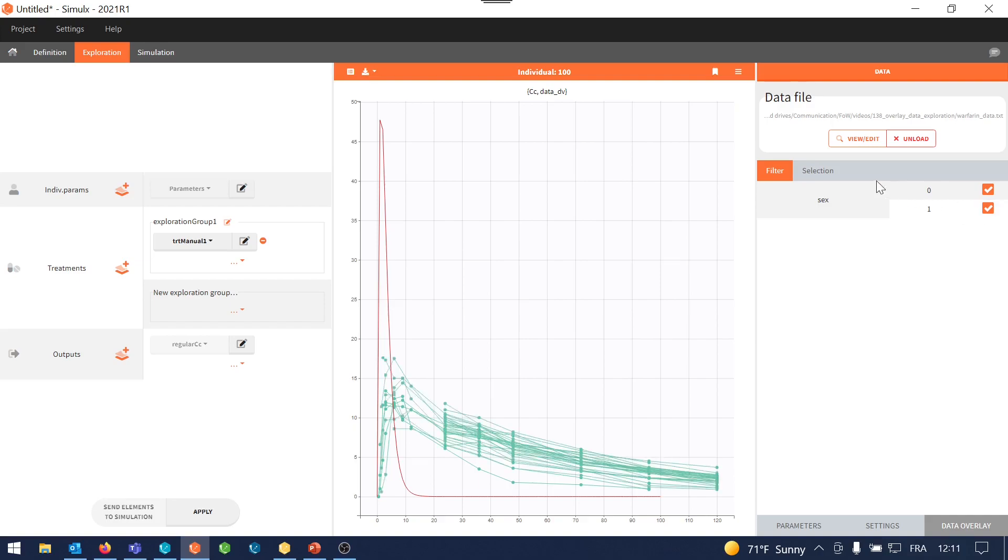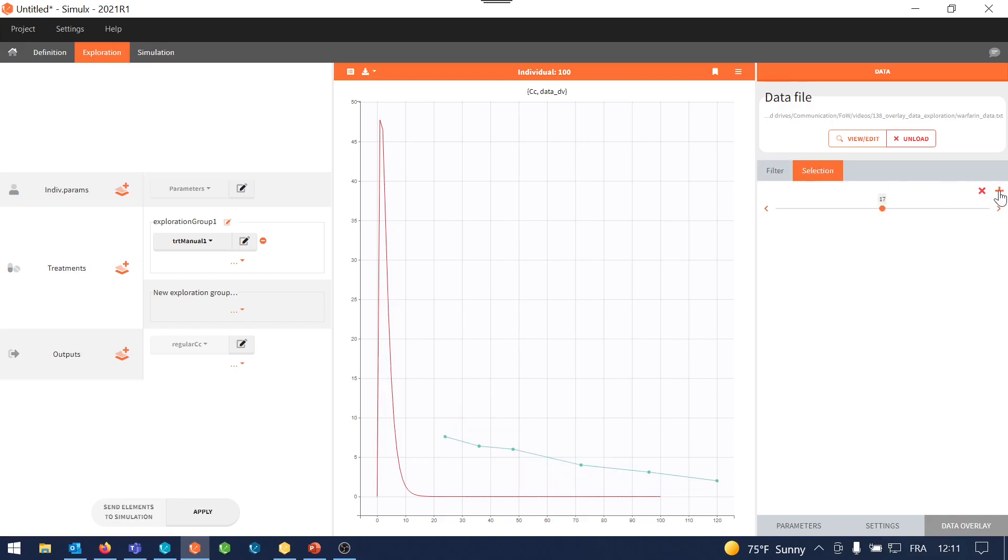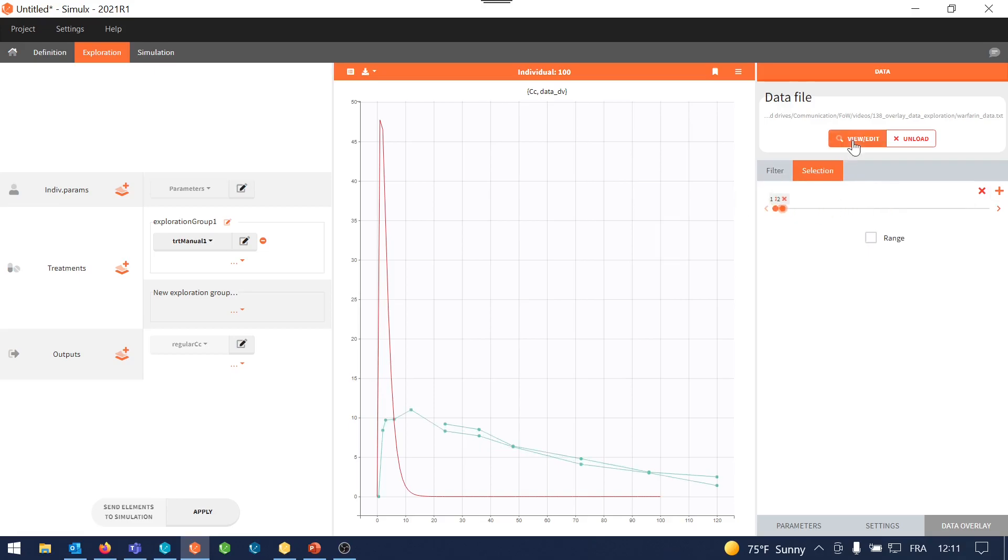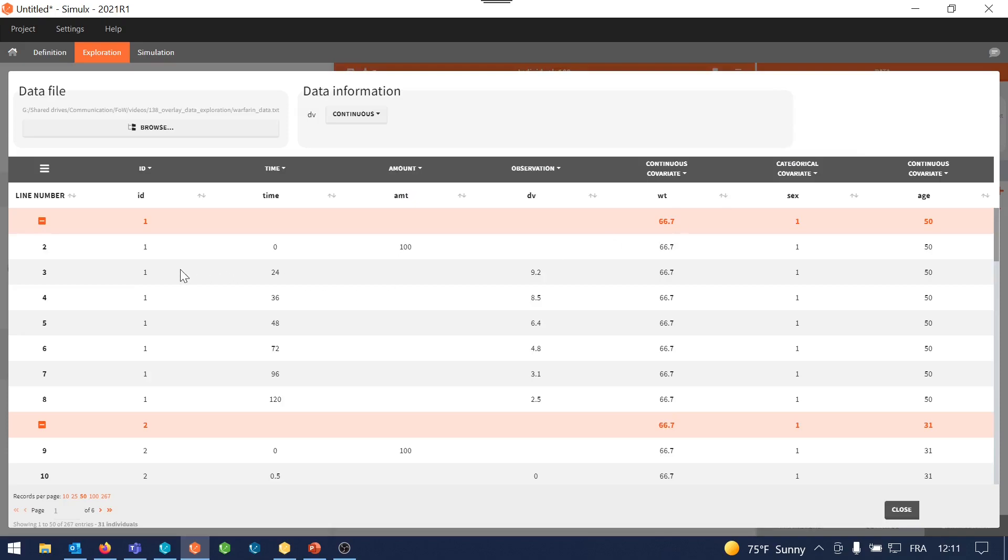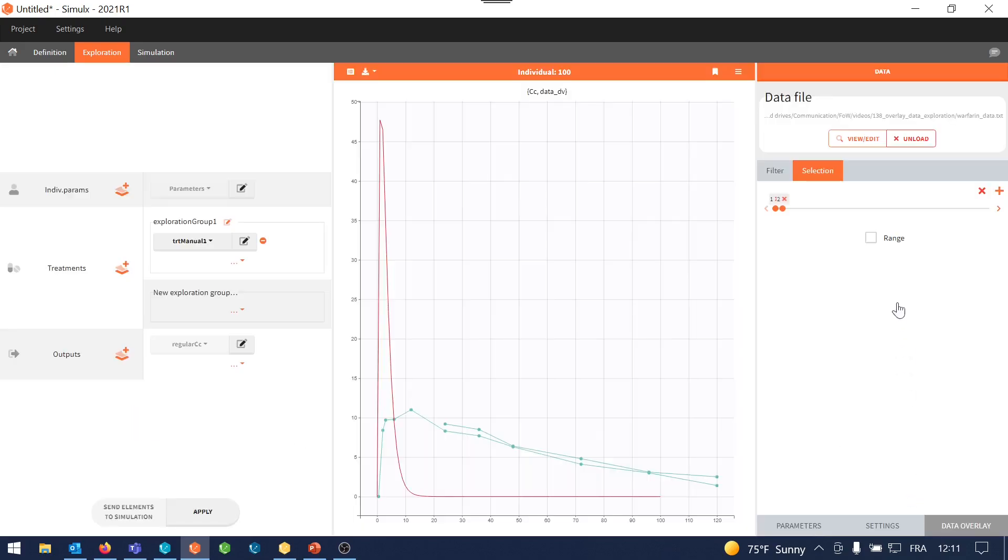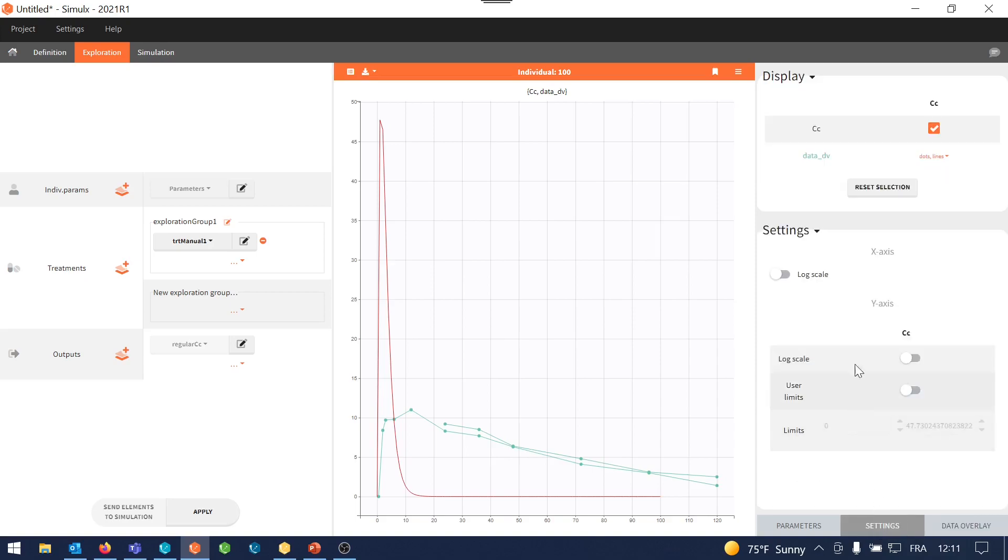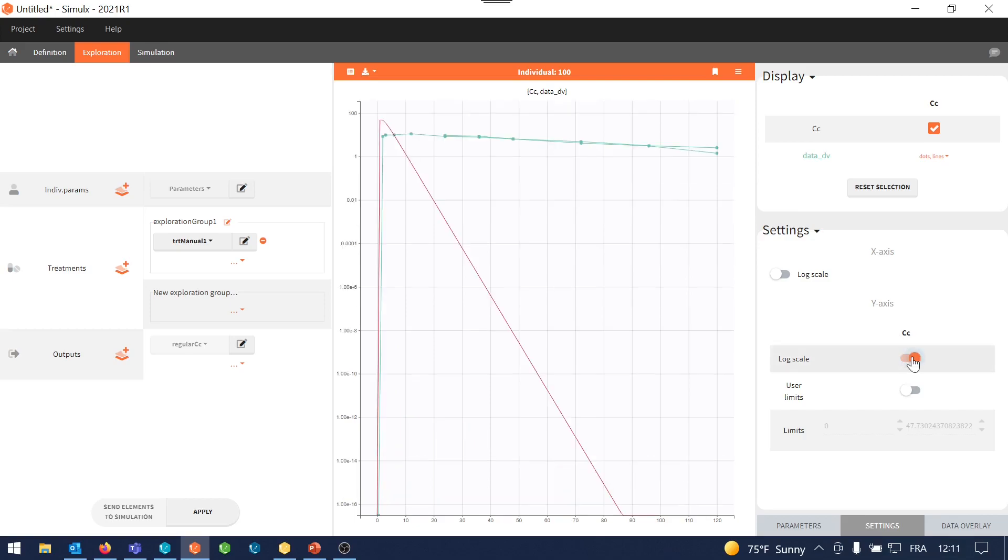I can also select the first two individuals who received a 100 milligram treatment. So I can check here in the dataset that IDs 1 and 2 received 100 milligram. I select them. They are displayed on the plot. So now I would like to set a log scale on y-axis to view the elimination phase better. So I can set the log scale like this.